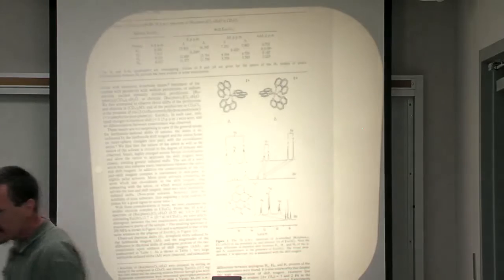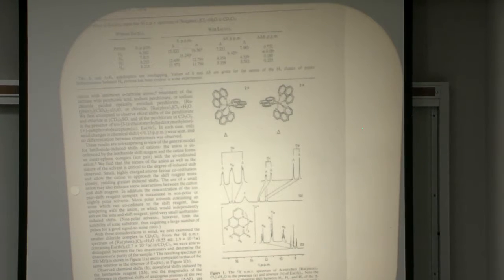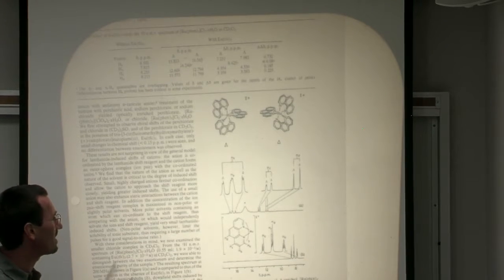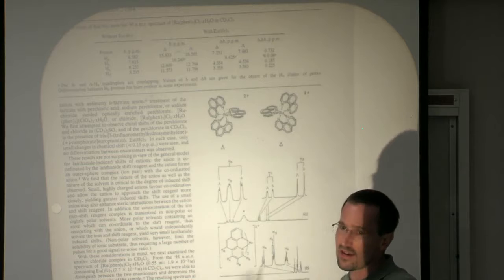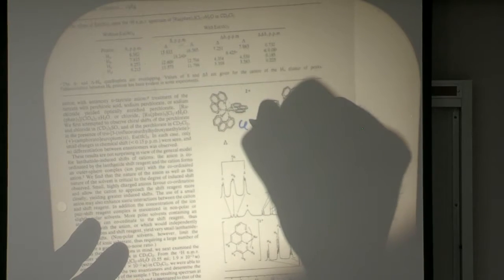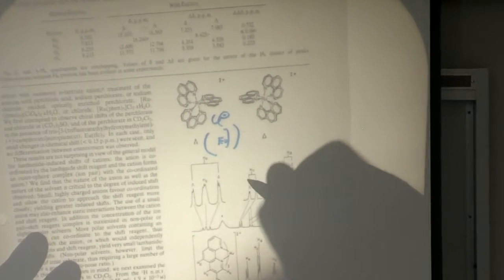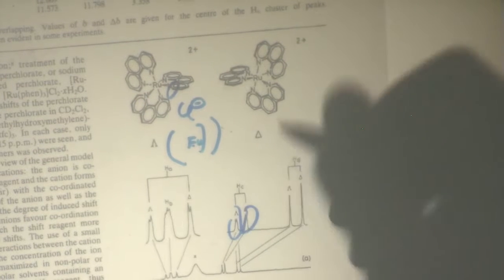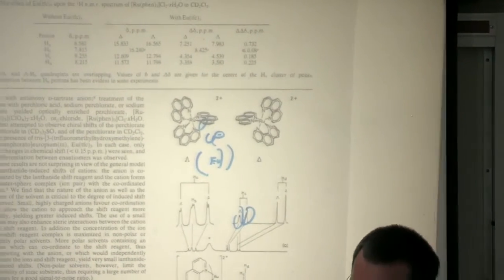All right, this next example here, and I'm just putting this in, it's pure self-gratuitousness. This is of very little scientific value. It happens to be the first paper I published as an undergraduate, and it was just using chiral shift reagents in a very unusual way with molecules that basically was a tight ion pair, but it was determining enantiomeric ratios in a ruthenium complex. And so what was happening was it was done in a non-coordinating solvent, and so the chiral shift reagent was coordinating through chloride to the ruthenium complex, and you could see the various protons of the ring would separate. So this is the phenanthroline ring, so you could actually see the two enantiomers. Anyway, I've had a long-standing love affair with NMR spectroscopy, and maybe it's part of where it started.